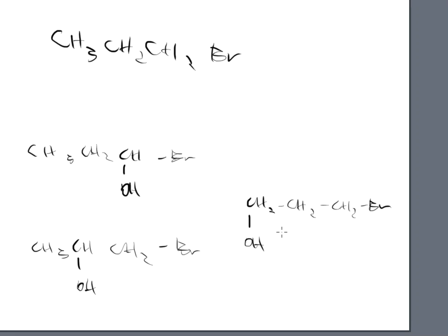In other words, do these provide me different names? And I hope that you can look at this without naming them. And I hope that you can just immediately say, yes, based on what you taught me this semester with alcohol nomenclature and alcohol reactions, they are all 3 different names. And because of that, they all 3 give me a signal.